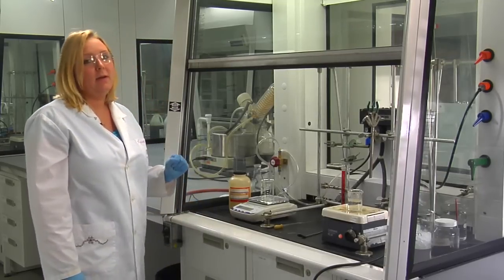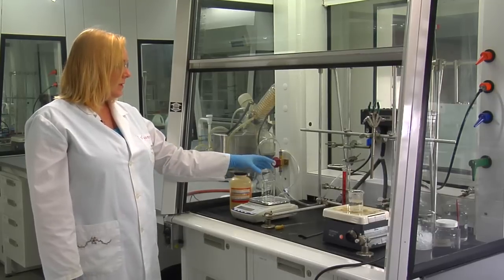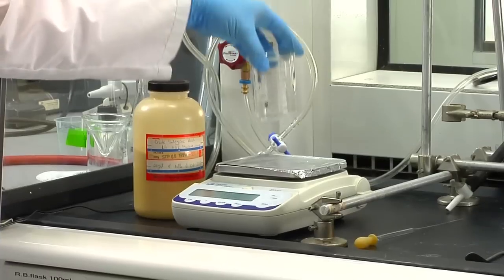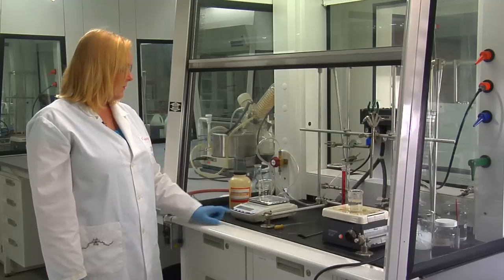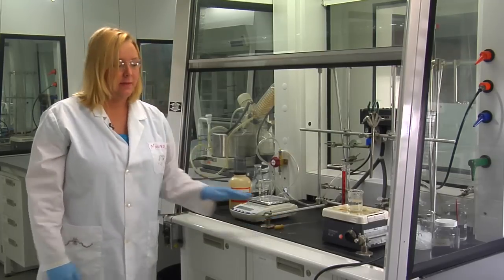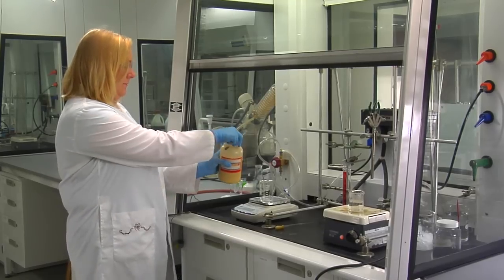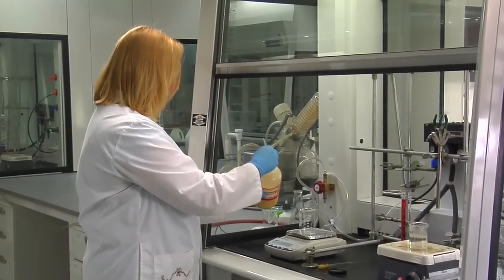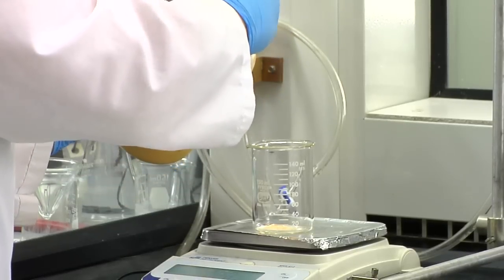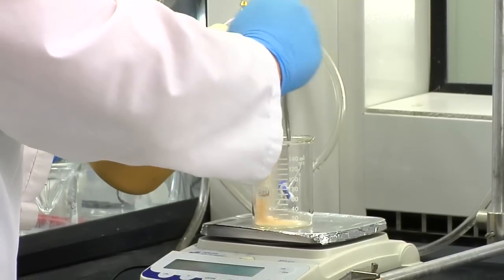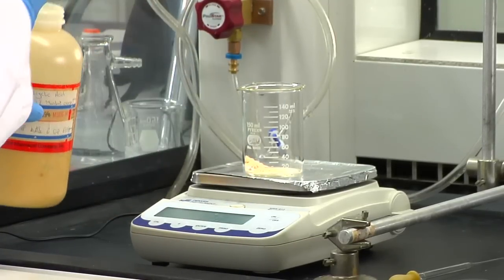Once you have that set up, we're going to weigh out our salicylic acid containing the colored impurity. Using your balance, you're going to get a beaker and place it on the balance, and we're going to zero the reading. Once it displays zero, we can then weigh out approximately one gram of our salicylic acid. You want to make sure that you don't get any of the salicylic acid around the balance, otherwise your reading will be inaccurate.